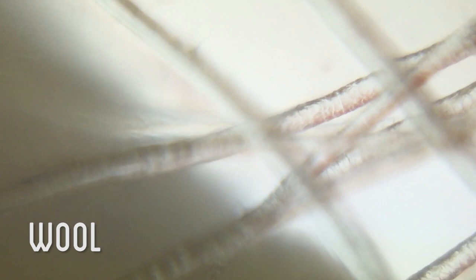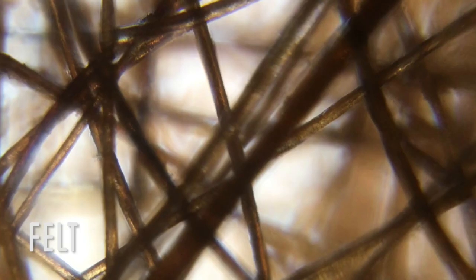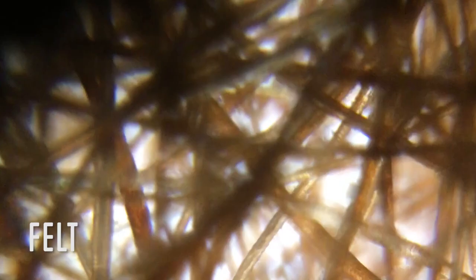Here's a close-up of some wool from the sheep I sheared. If you look closely you'll see tiny barbs on the hair — that's what allows wool to be felted when the hairs connect with each other. And here's a close-up of some of the felt I made, where you can see how the hairs are all interlocked.